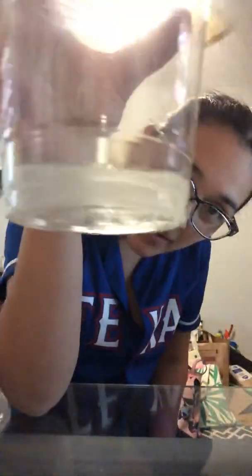So we're on the third column for vinegar and magnesium sulfate. Right now I would write that there was a temperature decrease, the crystals dissolved, and maybe a slight yellow color. It's not really much of a color change though.